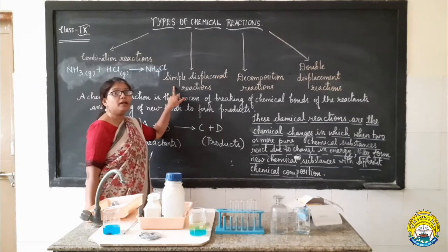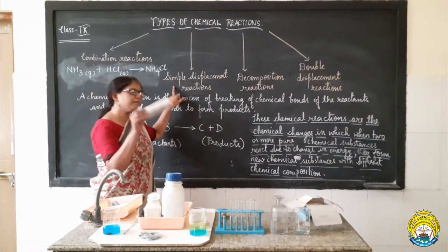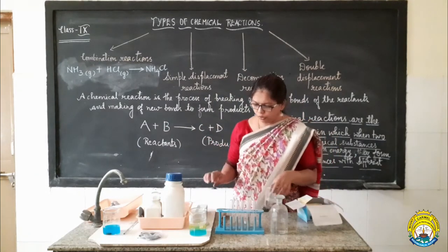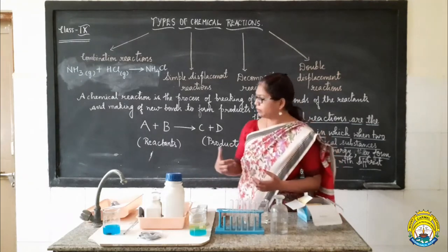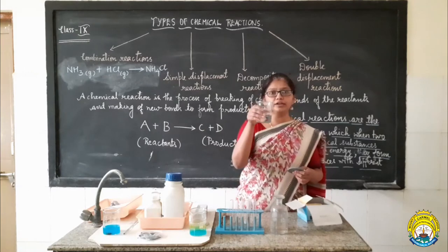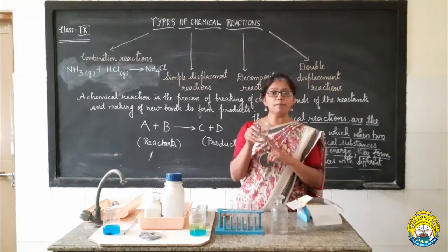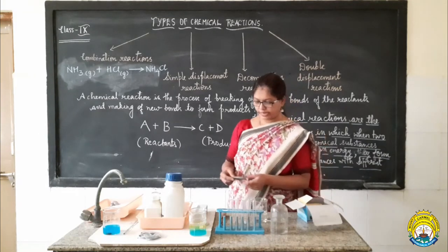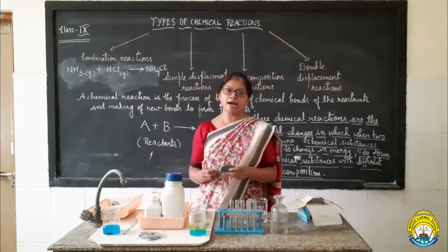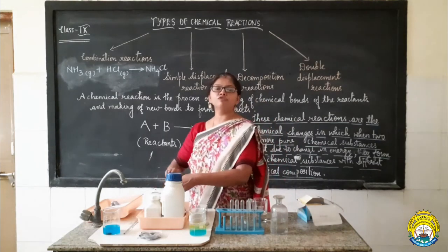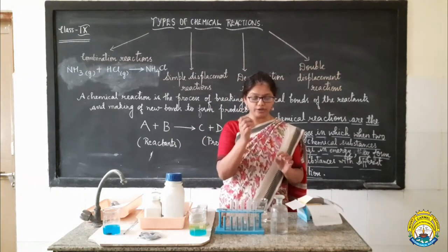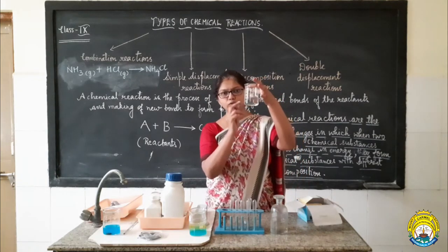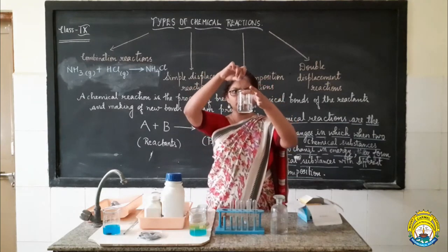Now let us come to the second type of chemical reaction, known as simple displacement reaction. Let me show you something to demonstrate a case of simple displacement reaction. Here in this beaker I have taken a small amount of dilute hydrochloric acid. And to this hydrochloric acid, I am going to add a few pieces of zinc metal strip. This is zinc metal strip. I am going to add it to this beaker which contains dilute hydrochloric acid, and just see what change is observed.